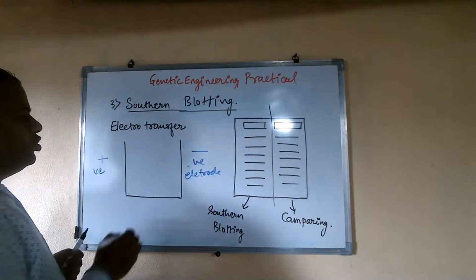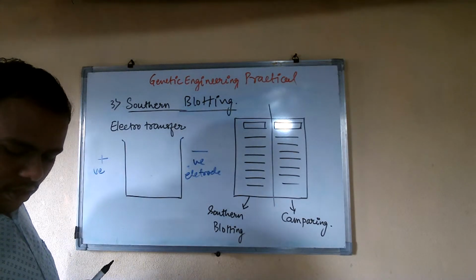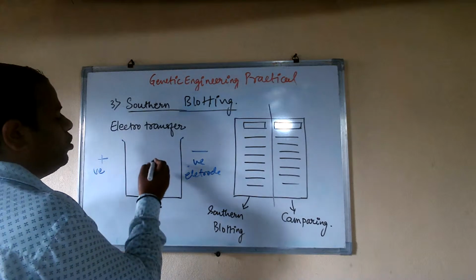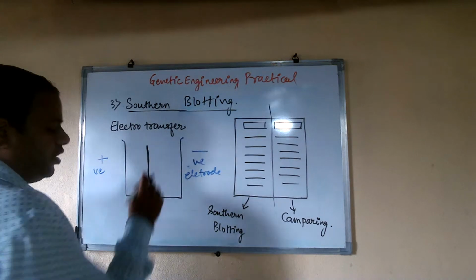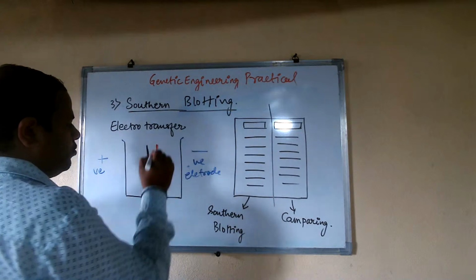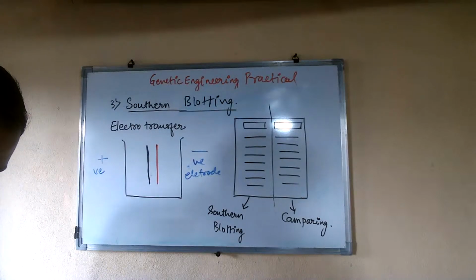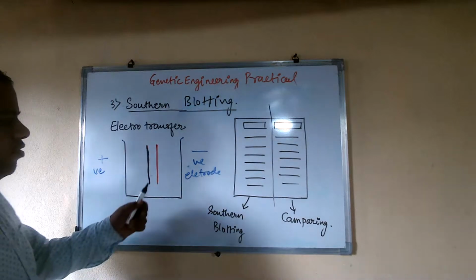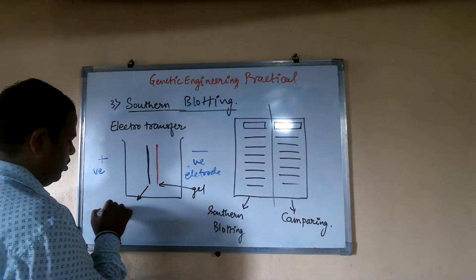Now you have to first place the nylon membrane on this side, suppose, and here there will be the gel, and this is the nylon.